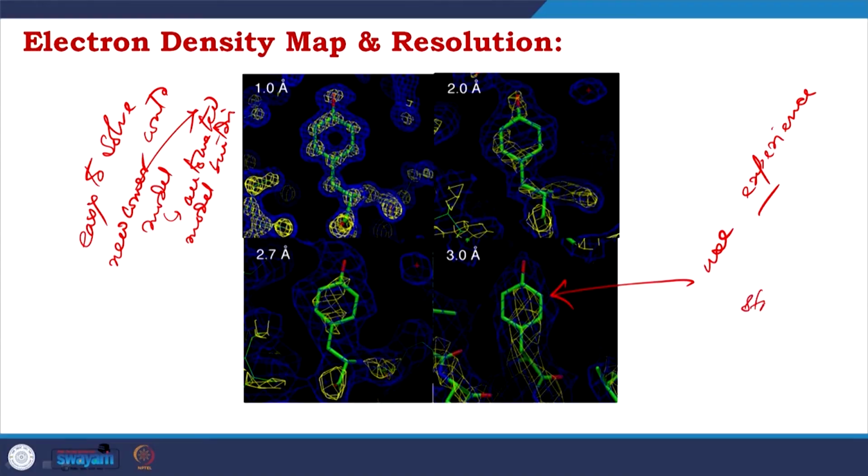We all say that when you look at a crystal structure, it gives you a static representation. But now through the course I have talked about, you understand that a crystal has a lot of water channels, and small molecules could change conformation. So, it is not exactly static, the protein loops are moving and all. So, there is considerable flexibility. But when you are modeling, you prefer one high resolution conformation. With more high resolution, you might get too much information which you do not require.